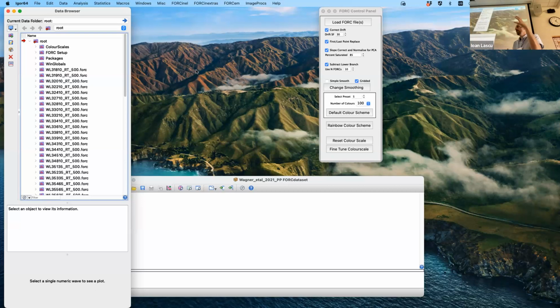So that depends on how the data spreads. Is that not answering your question? No, that's okay. I mean, by definition you're going to have more variability along PC1. Right. So we'll see what happens with this particular data set.